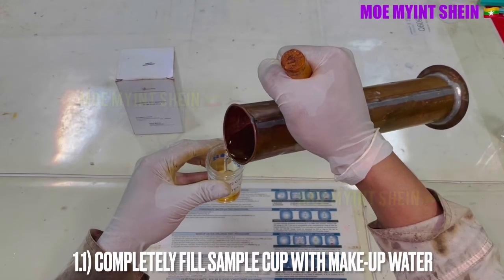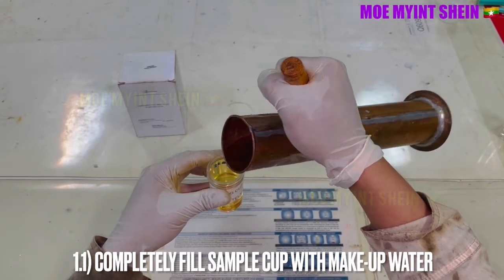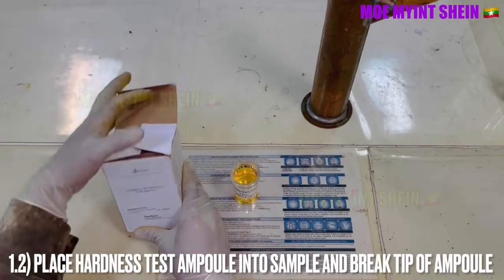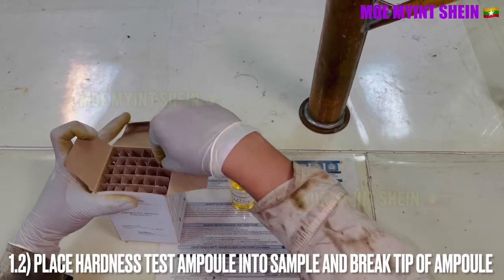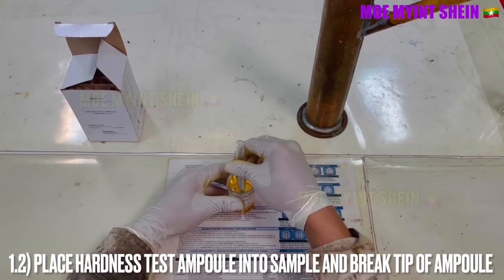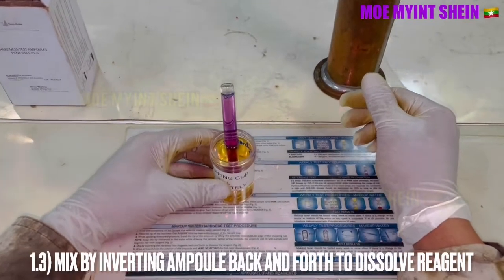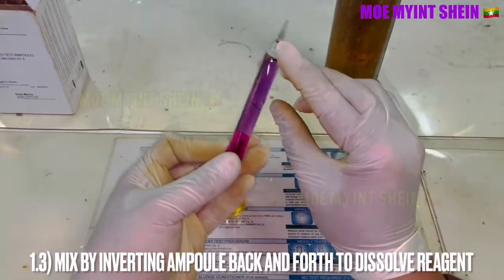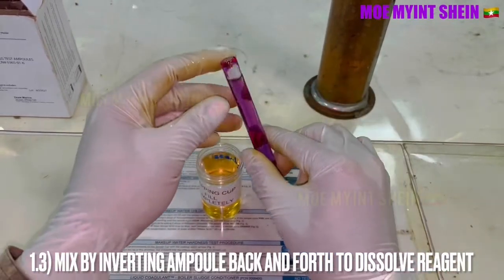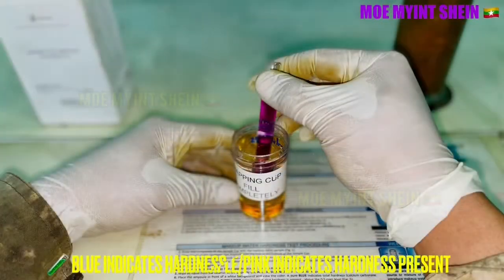The sample cup is completely filled with makeup water. Place the hardness test ampoule into the sample and break the tip of the ampoule. To dissolve the reagent, invert the ampoule back and forth several times. Blue color indicates hardness is less than 0.5 ppm; purple or pink indicates hardness is present in the water.